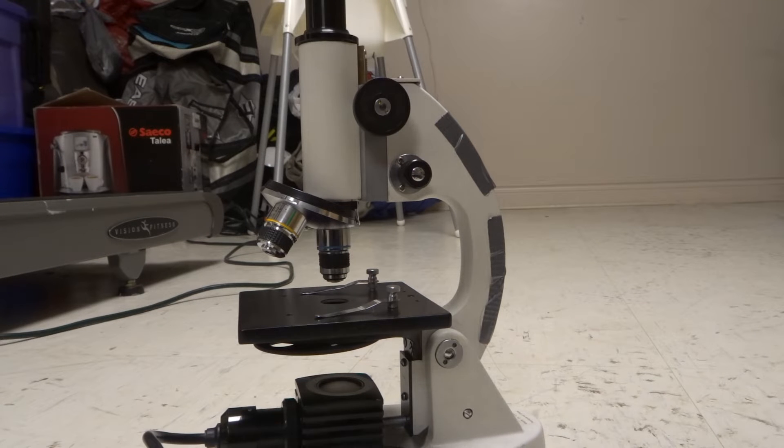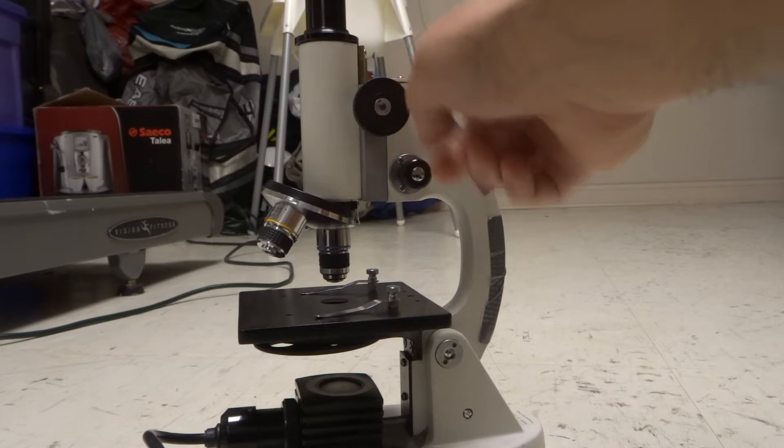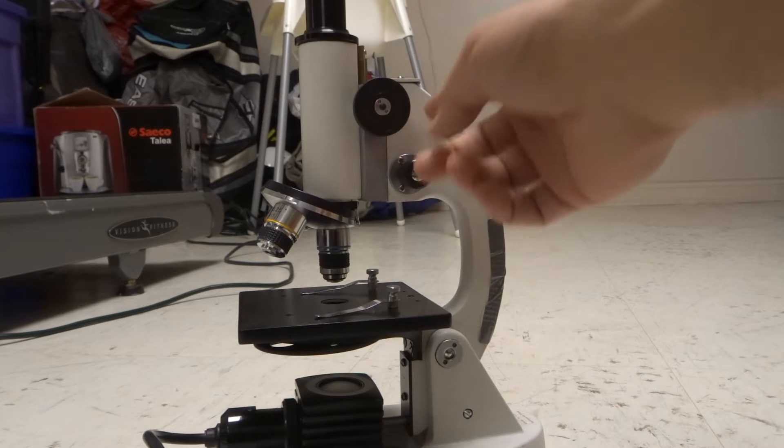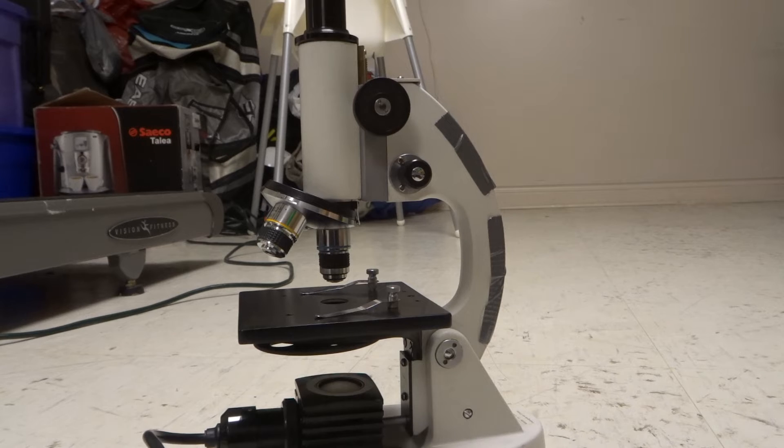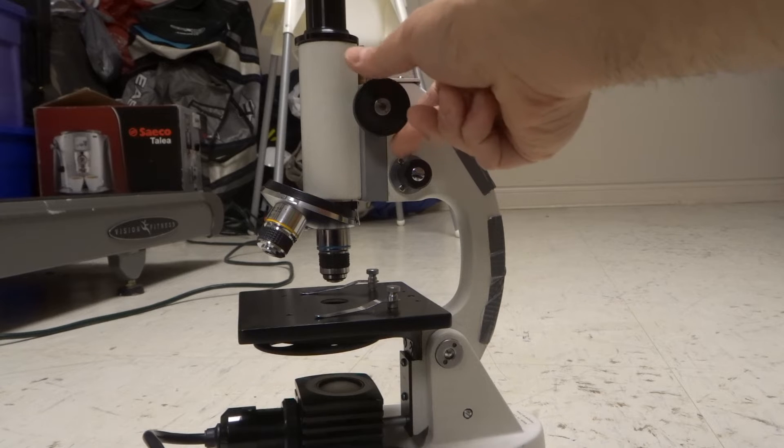The next thing that you want to do is observe the two knobs that you likely have on the microscope. They might be on the same axis or they might be like this on separate axes as you can see right here. Now one of them is going to be a coarse adjustment knob and one of them is going to be a fine adjustment knob. The coarse adjustment knob, when you turn it, it will move the microscope tube drastically.